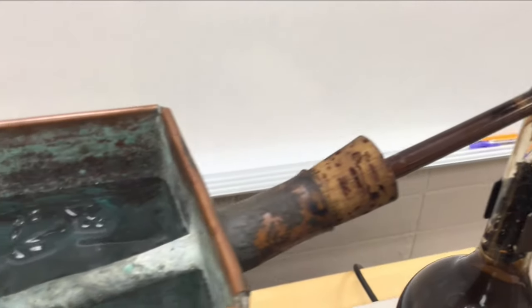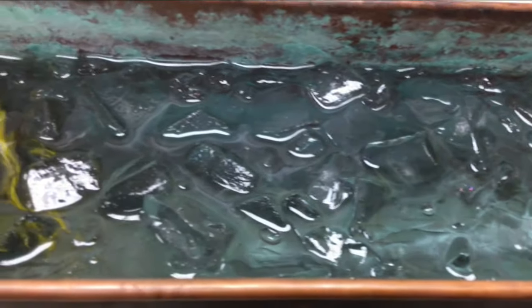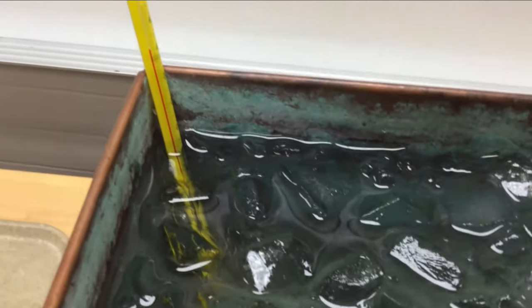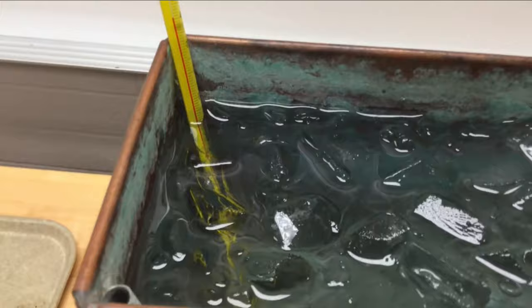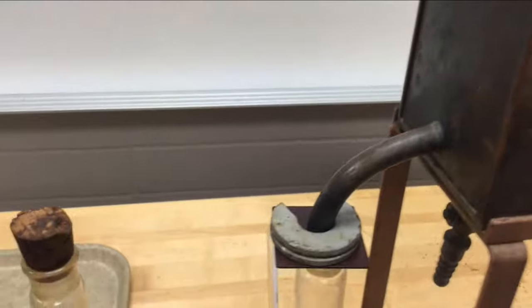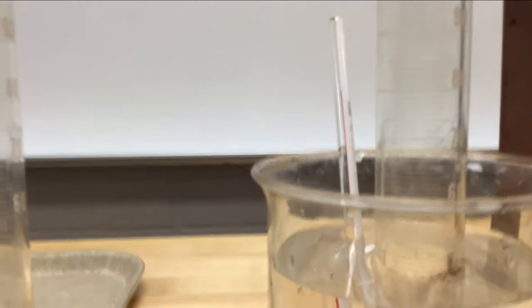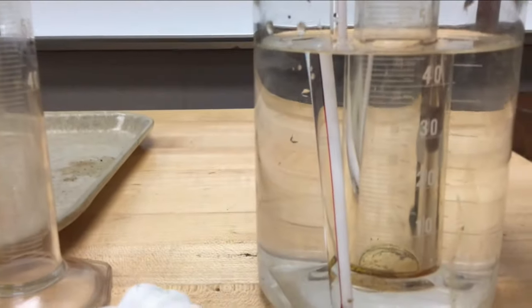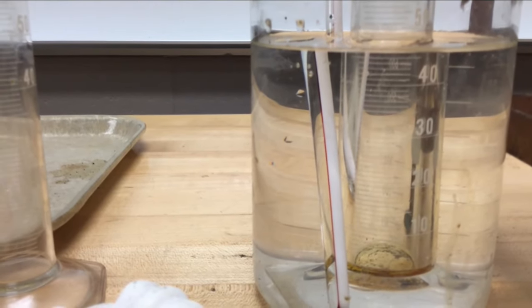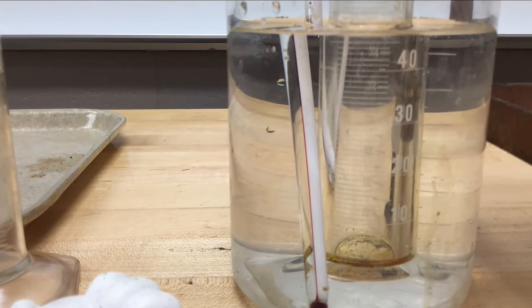Okay. We can take a look at the condenser, and you can see the ice water going down through the tube of the condenser. My thermometer on the condenser is reading around 40 degrees, so a nice bath of ice. Then as it's coming out of the tube and into my graduated cylinder, I look down here and see where we're at. We can see a drip there, and we started seeing a little bit of gasoline being accumulated, another drip there.